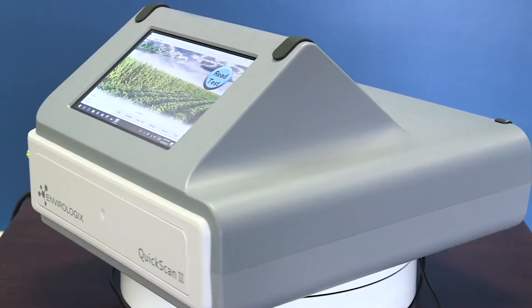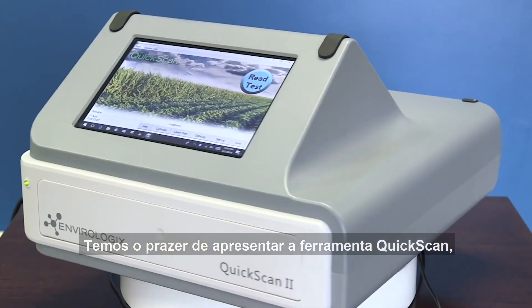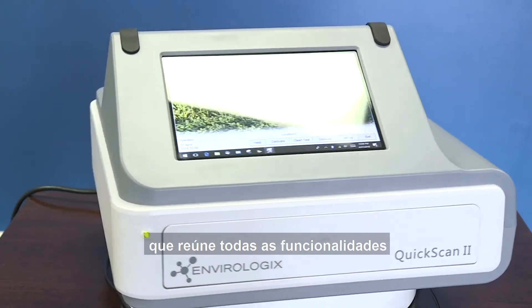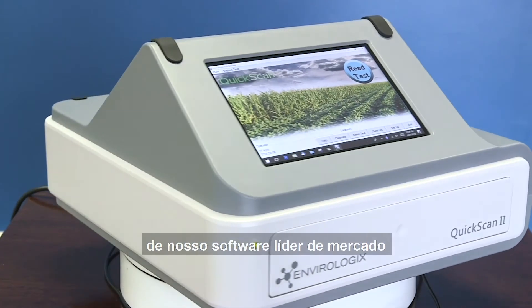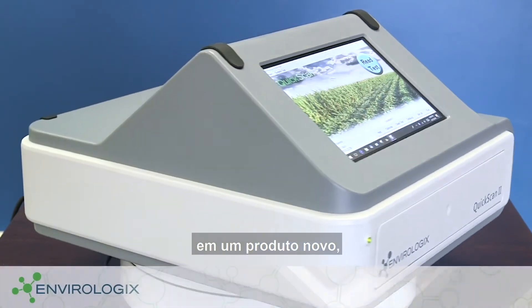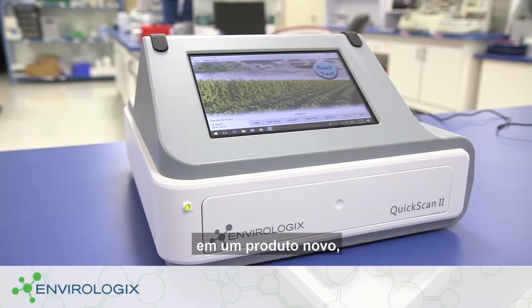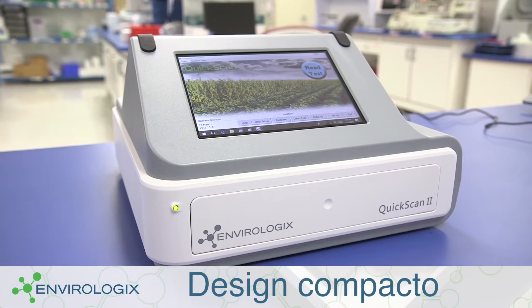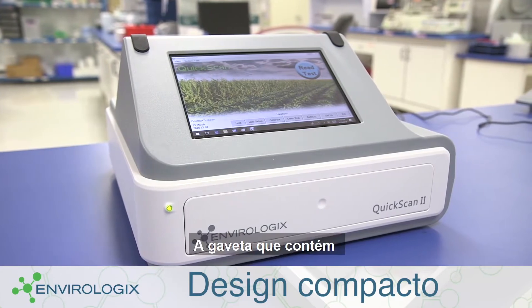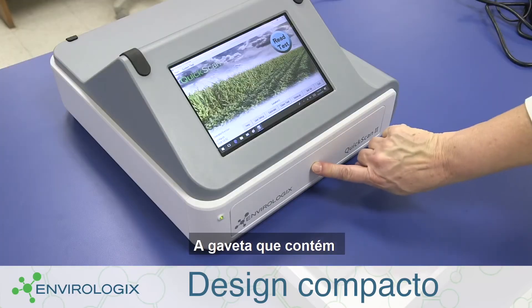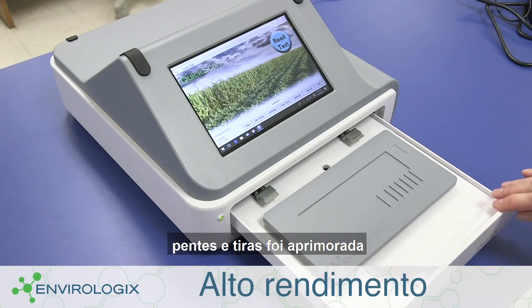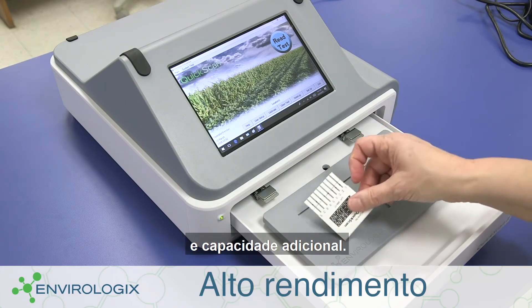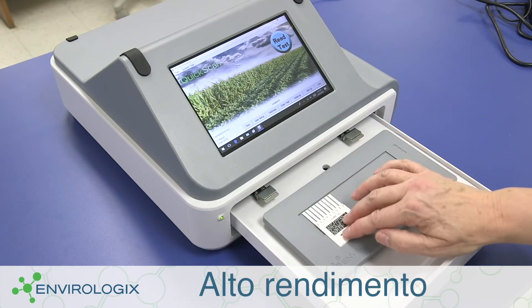We're pleased to present QuickScan 2, harnessing all the capabilities of our leading software solution in a new sleek and streamlined footprint. The drawer that holds the combs and strips has improved recesses for easier loading and expanded capacity.